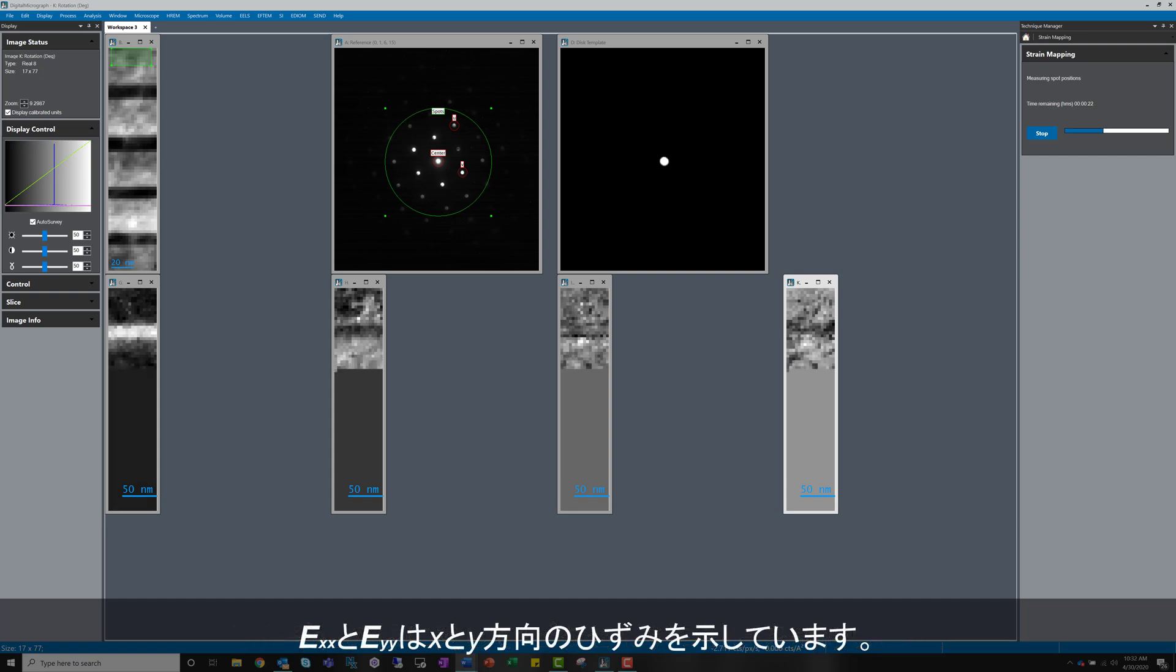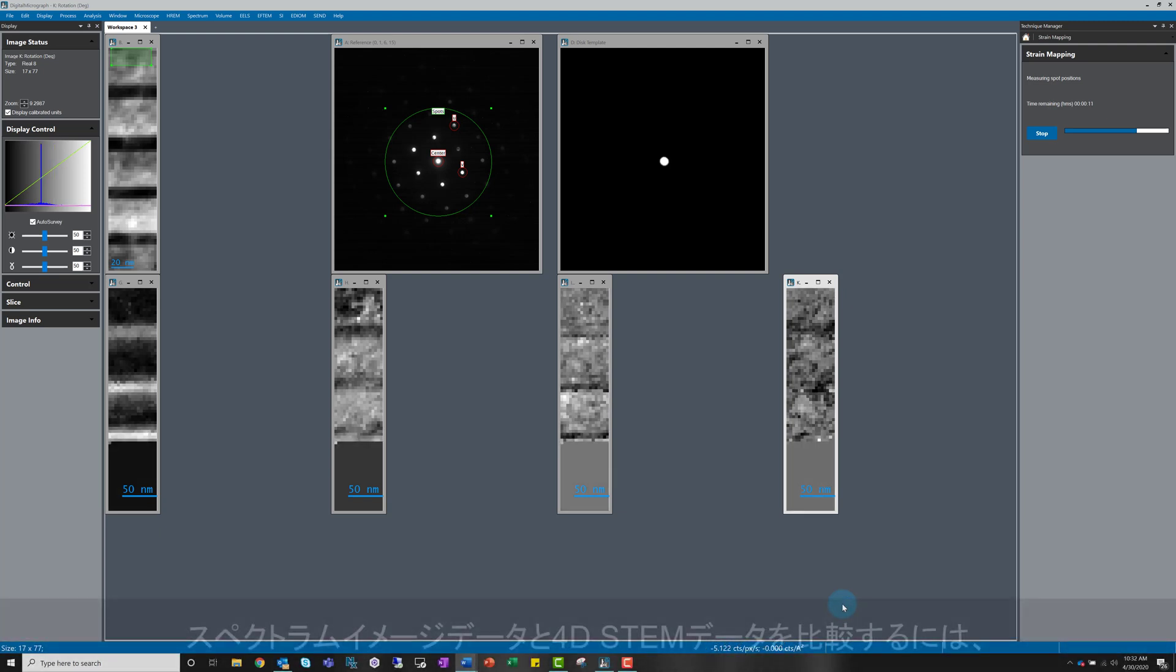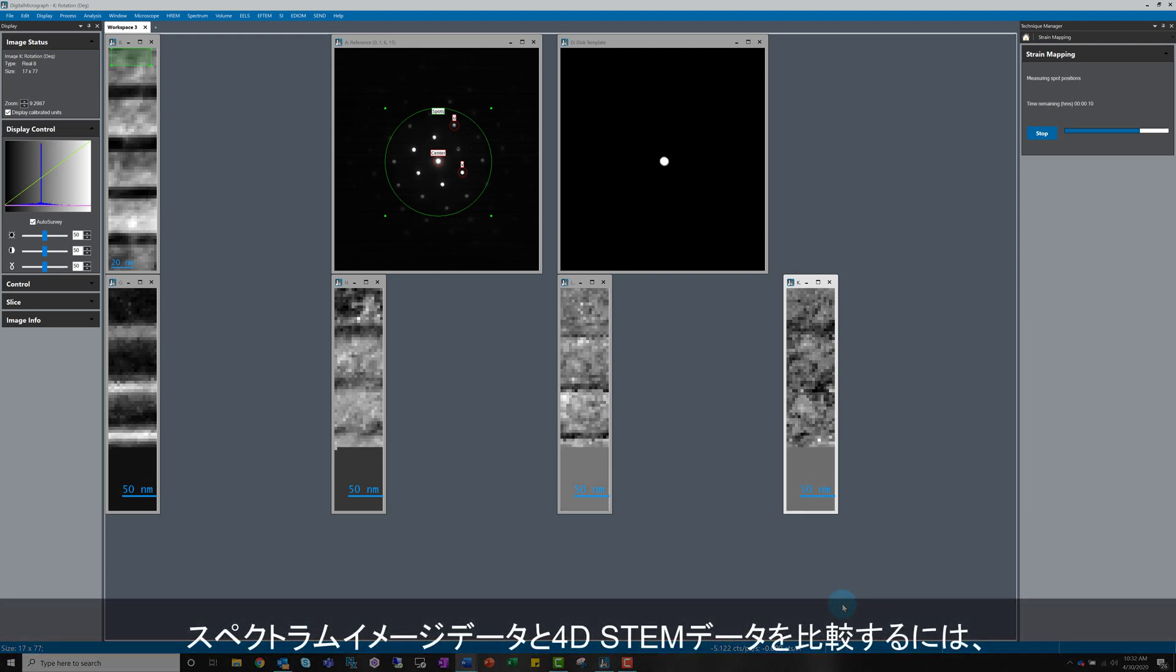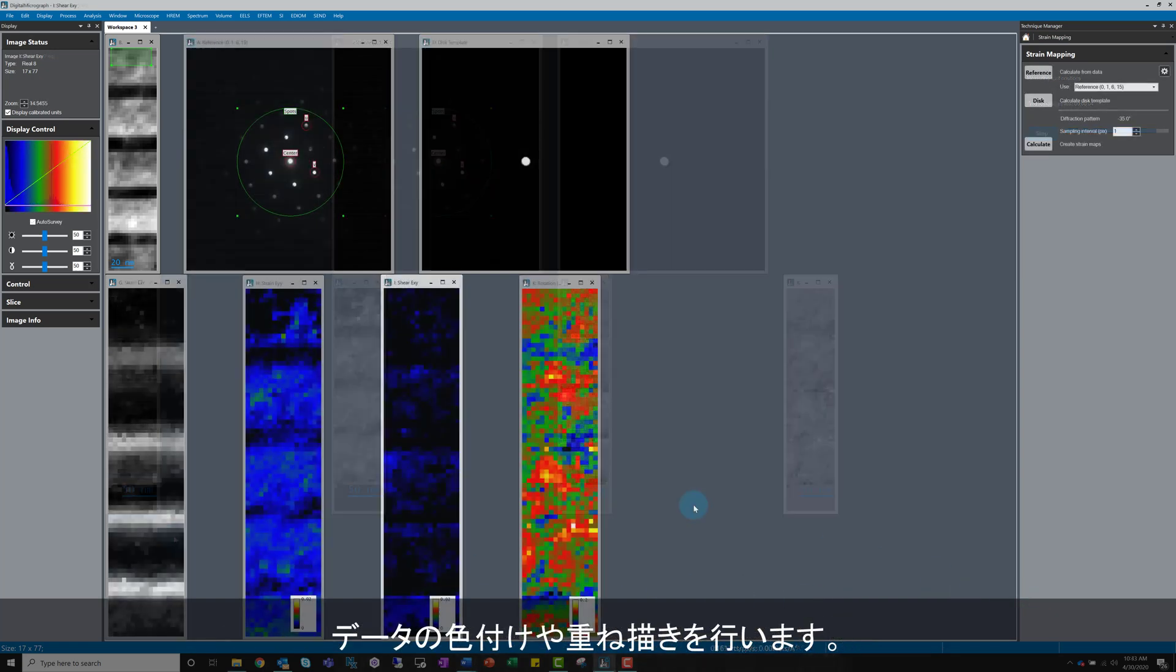EXX and EYY are the strain in the X and Y directions. Remember, this is the XY coordinate of the diffraction image with the rotation applied. A nice way to compare maps from Spectrum Imaging and 4D STEM data is to colourise.